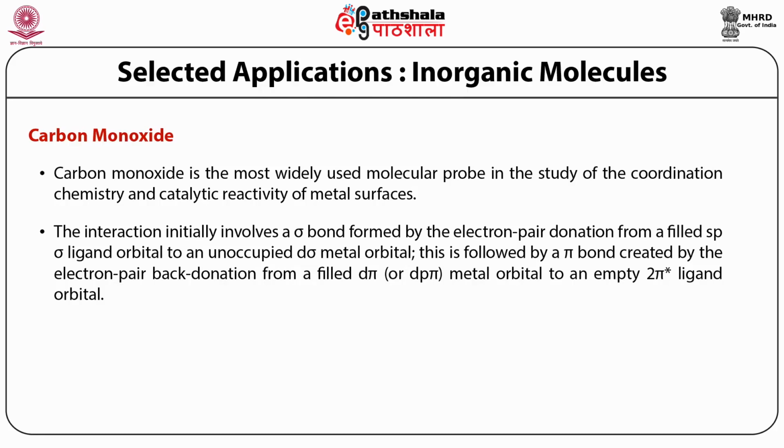This is followed by a pi bond created by the electron pair back donation from a filled d pi or dp pi metal orbital to an empty 2 pi star ligand orbital. As a result of the surface coordination, the CO bond is weakened and nu CO, the vibrational frequency of the CO stretch mode, 2143 wavenumbers or 266 milli-electron volts in the gas phase, undergoes an appreciable redshift.